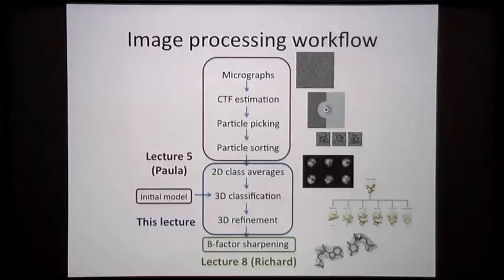By convention in the field, a whole toolbox of different programs has been used in different types of algorithms. Many of them I will not speak about. I will not speak about anything about multivariate statistical analysis, which has been very popular, no neural networks, anything like that. I will focus on multi-reference or single reference refinement of images, and I'll tell you what that means. The reason I do that is that most likely that's what you're going to use.